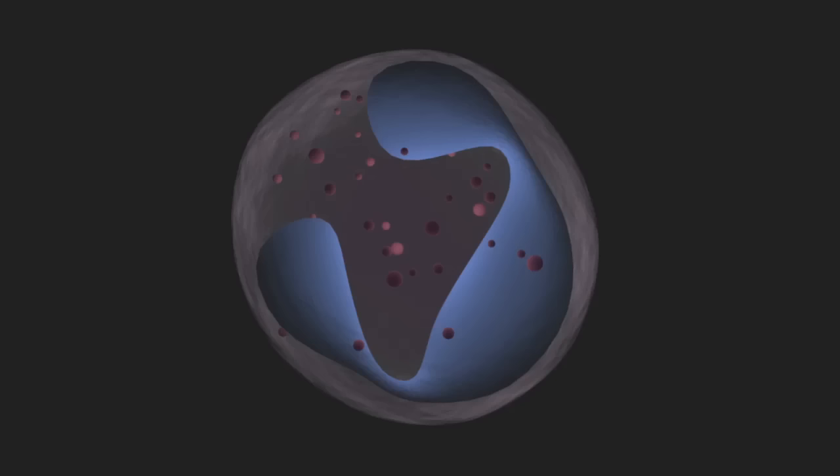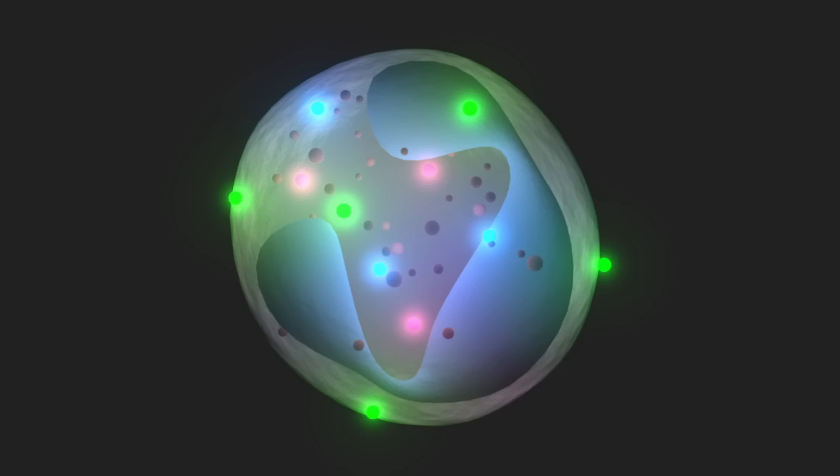In addition to analyzing a cell's size, shape, and complexity, a flow cytometer can also detect emitted light from excited fluorescent molecules, such as fluorescently labeled antibodies or fluorescent dyes or stains. For the rest of this animation, we will focus on the detection of fluorescent signal by the flow cytometer.